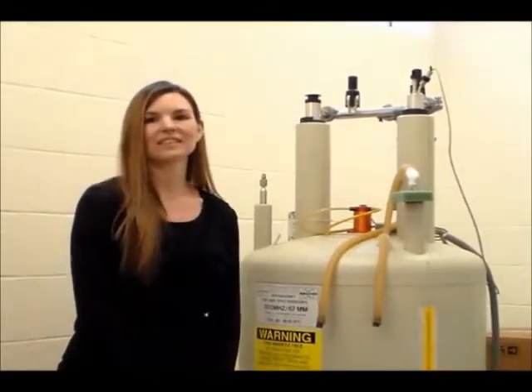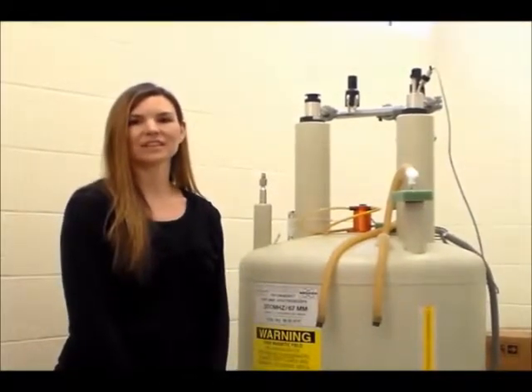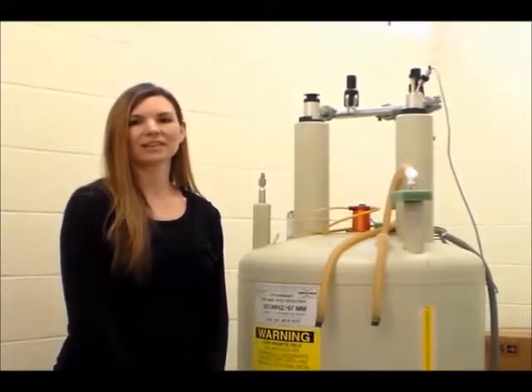Finally, this is our NMR room or nuclear magnetic resonance. This instrument looks at the molecule structure.